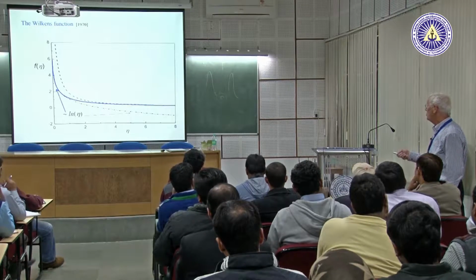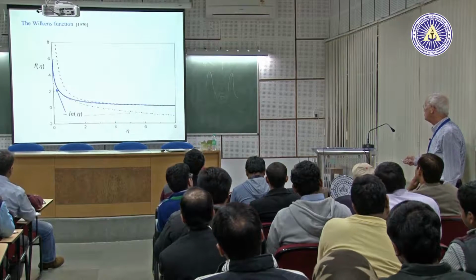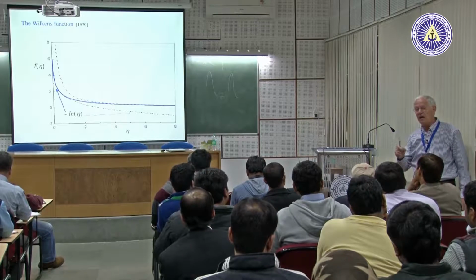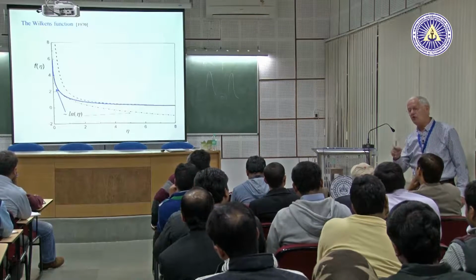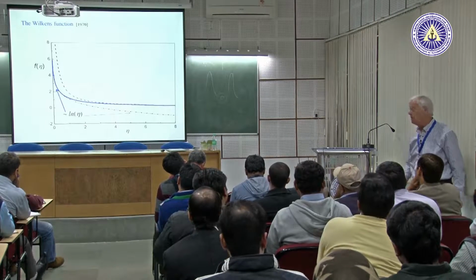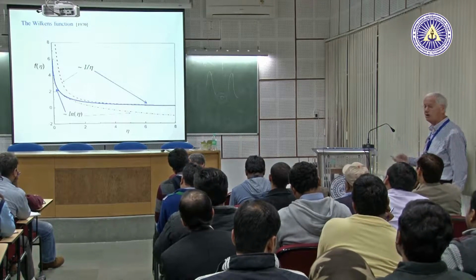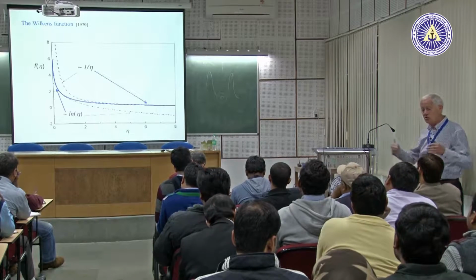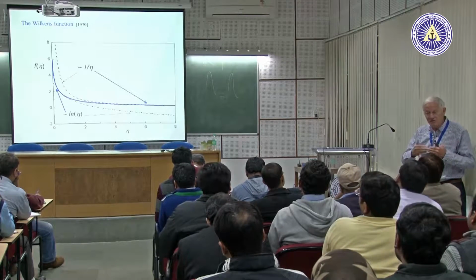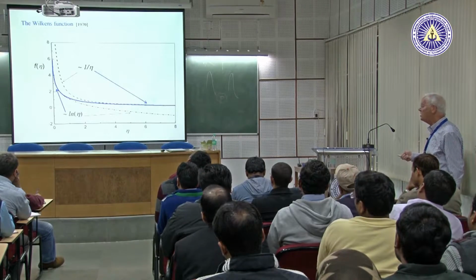So he showed that the asymptotic function at large eta values, where eta is the Fourier variable normalized with the outer cutoff radius, L over R_E, is a hyperbola, 1 over eta. He matched the two functions together just by brute force and produced this blue curve, which is working very well.